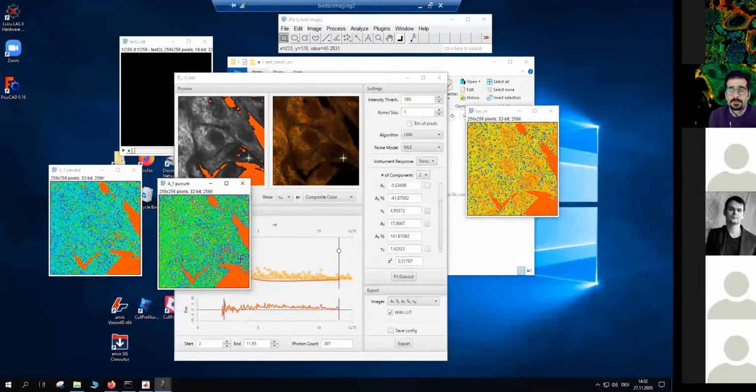So that's also possible. We have talked about calcium imaging using FLIM. We have talked about autofluorescence imaging using FLIM, addressing the cellular metabolism or the functionality of different samples. We have talked about using FLIM for clinical diagnosis, and also addressing biochemical questions, as well as being interesting for people studying, for example, stress granules, which typically have different lifetimes, or lipid formations under the different conditions we have for the tissues, inside the animal model and the cells and so on. So these are all parameters that we might need to analyze the data on another level.